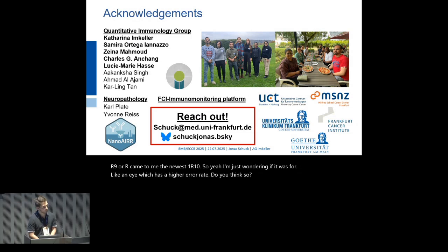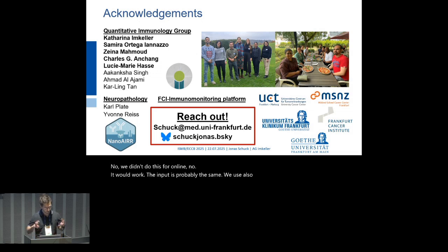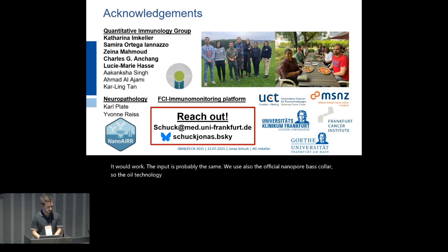What was the last part? Sorry. Do you think it was for like R9, which has a higher error rate? No. We didn't do this for R9, no. Would it still work? It would work, yeah. The input is probably the same. We use also the official Nanopore base caller. So the old technology probably has the same output, which you could feed into the tool.